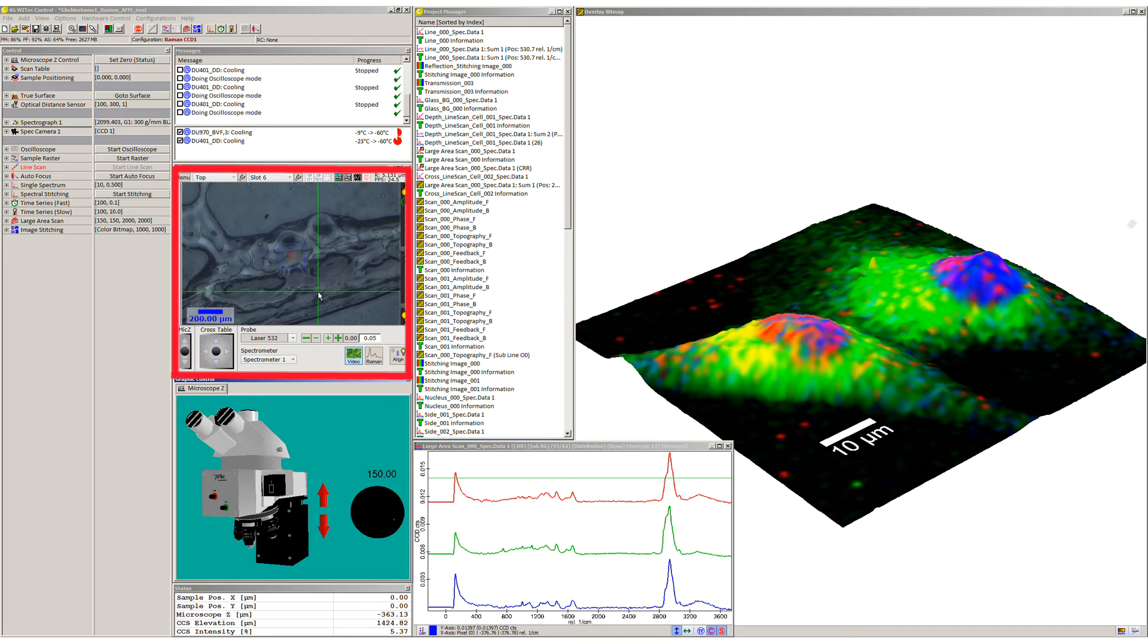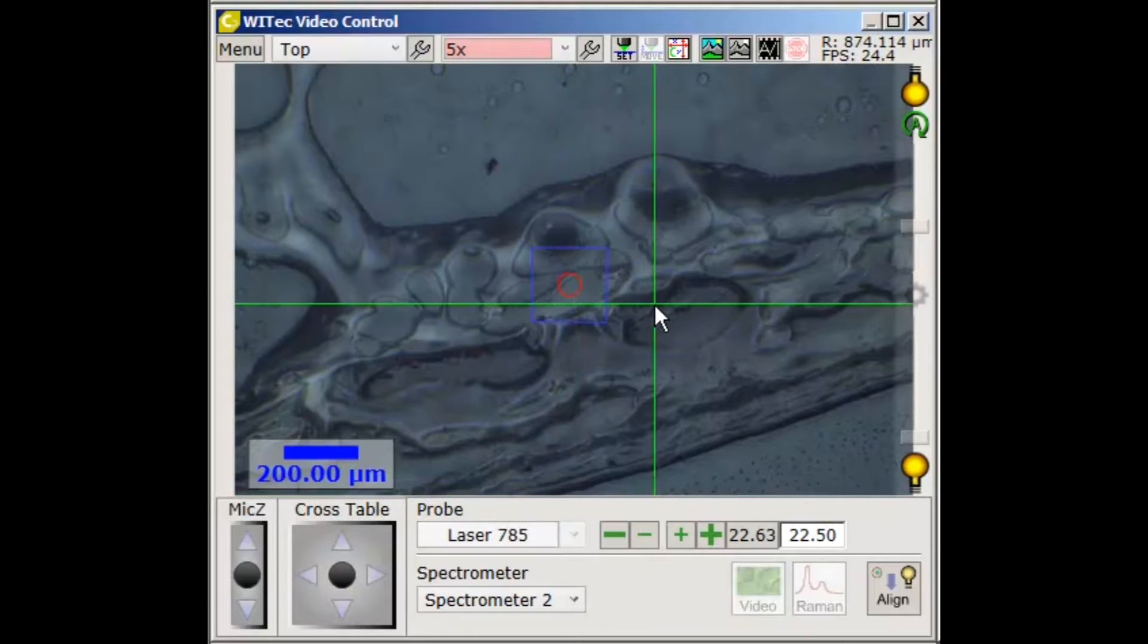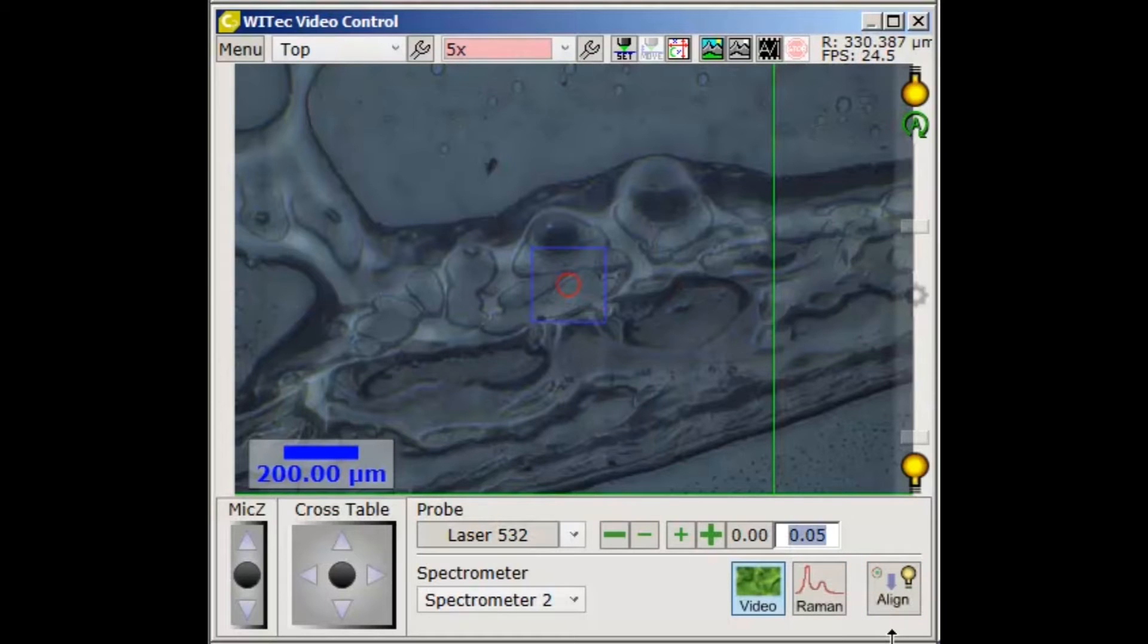With the video control app you can choose which laser you want to work with as well as its power. So for example for the 785 nanometer laser we can choose 212 milliwatts and we get 212 milliwatts or we can choose a lower power like 22.5 milliwatt and we get 22.5 milliwatts. You of course also can change the laser wavelength by just selecting the other laser here the system now automatically changes the laser wavelength and also here you've got the possibility to choose your laser power for example 42.5 milliwatts and we get 42.5 or 1.1 milliwatts we get 1.1 milliwatts you can also go lower laser powers even 0.32 milliwatts and we get 0.32 milliwatts.